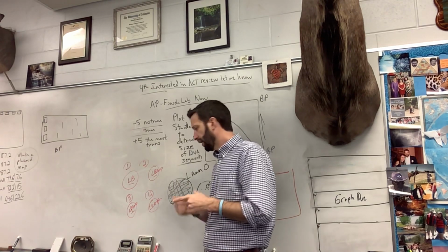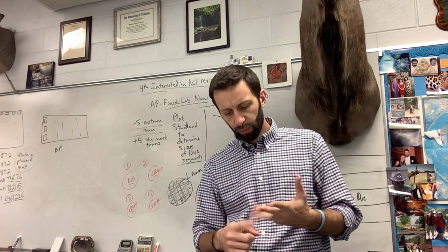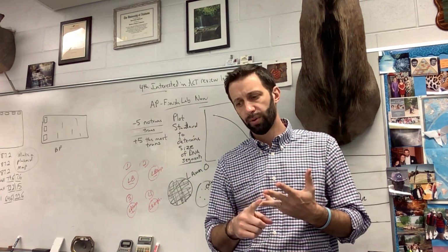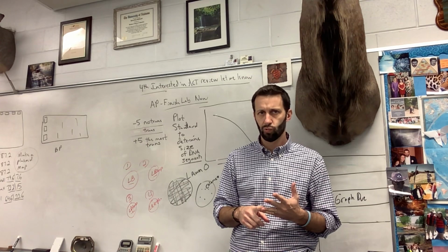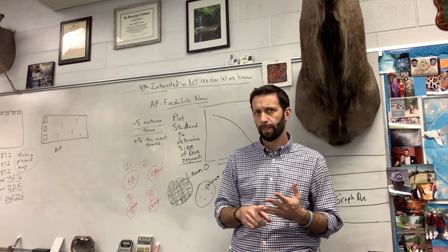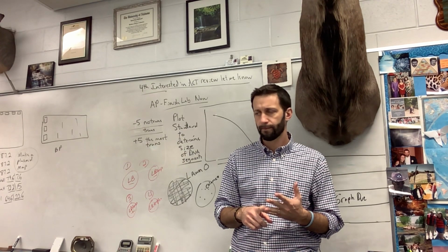Number 4, we've got LB, we've got the broth, we've got ampicillin, and we've got 1 other ingredient in there. What do we have in the gel? The sugar. We've got the sugar arabinose. What would you expect to happen in the 4th petri dish? What type of growth? Yes, colony.